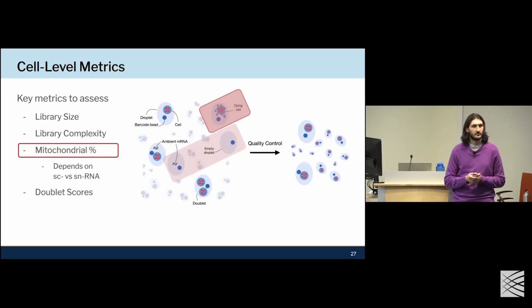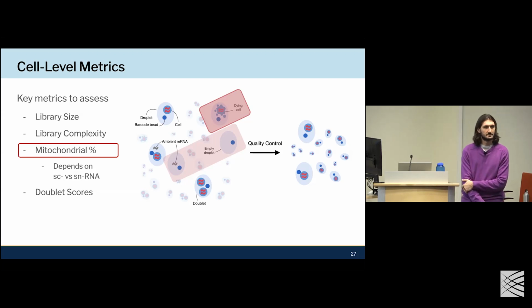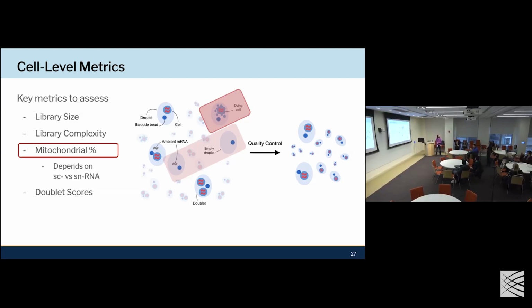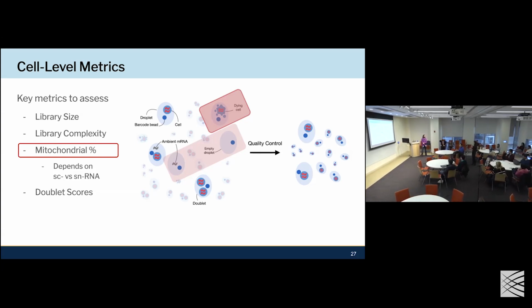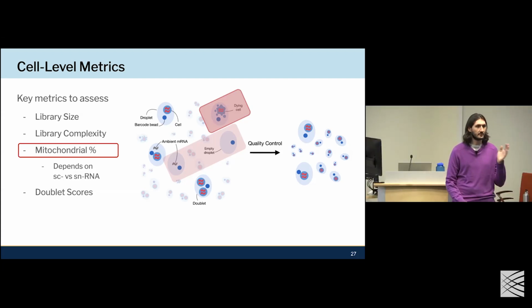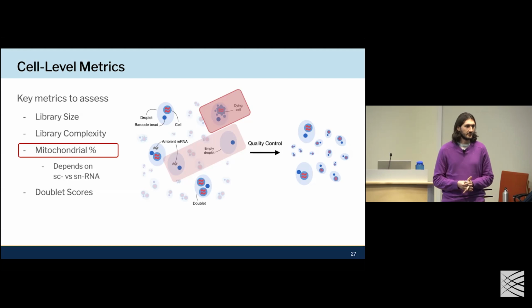Question related to single cell versus single nuke. We do single nuke because our cells are often in syncytia, so we need the separate nuclei. But then we really have to clean up the ambient RNA, I think, because the cytosolic RNA sticks to all the nuclei. Is that just us, or is that something you see generally? No, I think with the single nuclei, you can get more ambient RNA just because during the process it may not be fully clean or might be sticking. And you use CellBender in those cases? Yeah, I think CellBender is one of the most used tools for it.